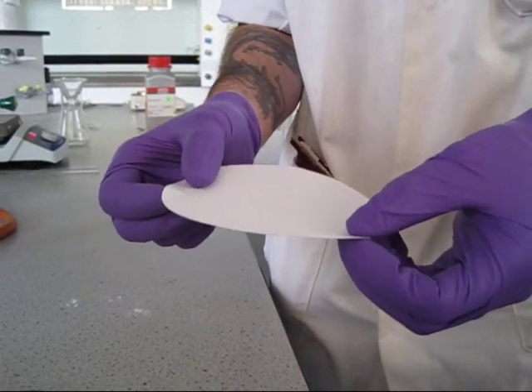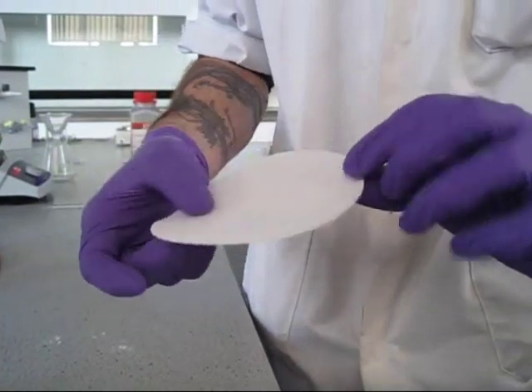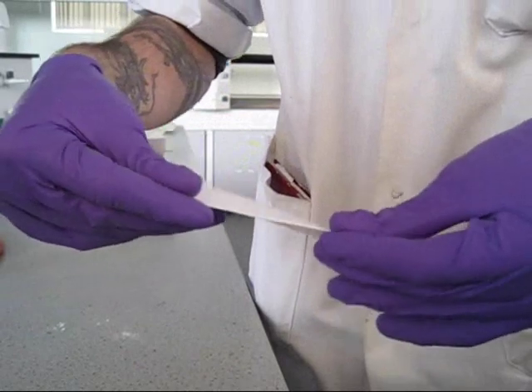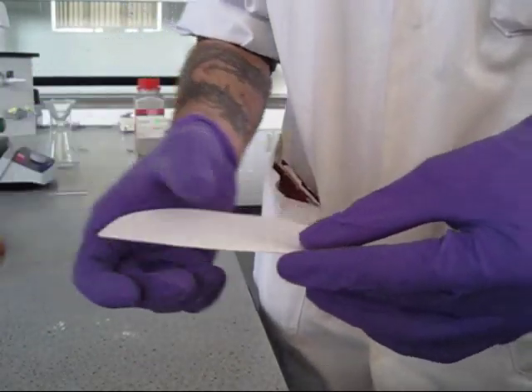To make a fluted filter paper, take your large filter paper, fold it in half, like so, and fold it in half again.